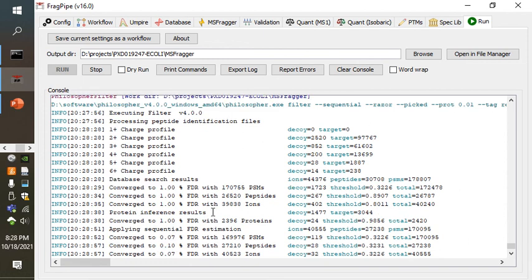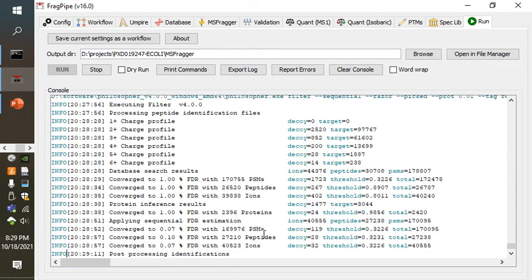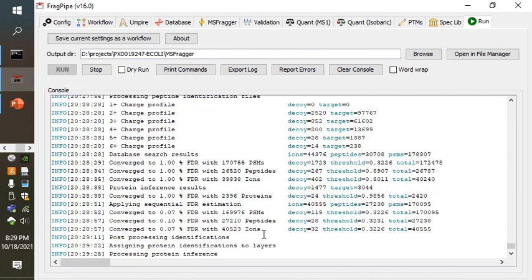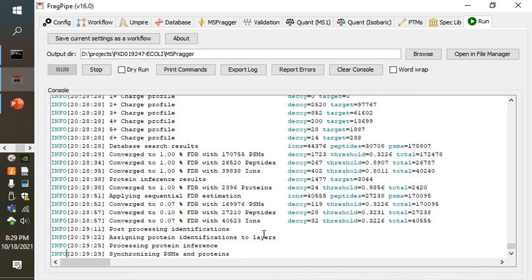So we can already get a quick sneak peek that this quick analysis has still been able to identify more than half of the proteins in the E. coli proteome, which is, as I recall, about 4,450, I think. So we can see that these relatively quick experiments of just single shots in 6 replicates were still sensitive enough with modern instrumentation. I believe this was on a Q-Exactive to give us a really deep look into that proteome.